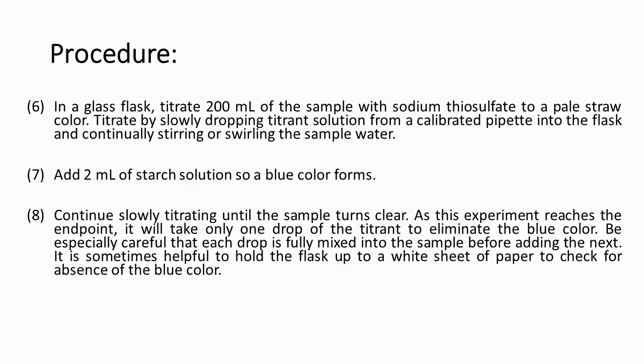After that, in a glass flask, titrate 200 ml of the sample with sodium thiosulfate to a pale straw color. Titrate by slowly dropping the titrate solution from a calibrated pipette into the flask while continuously stirring the water sample. Then add 2 ml of starch solution so that a blue color is formed.